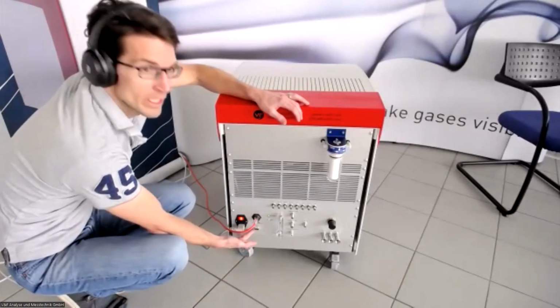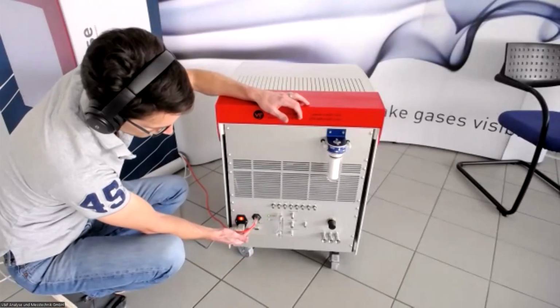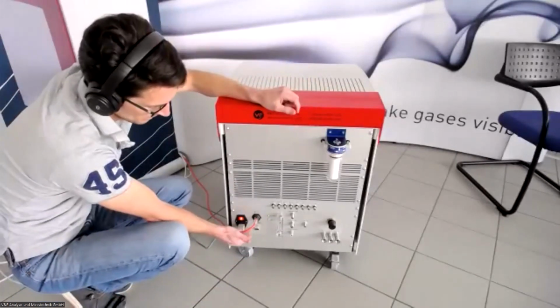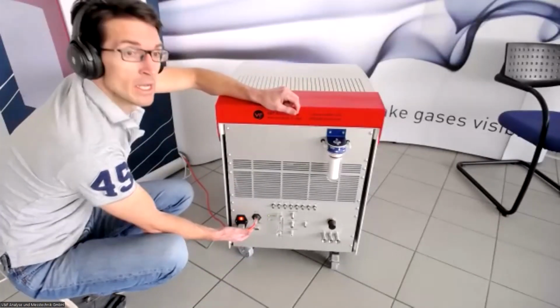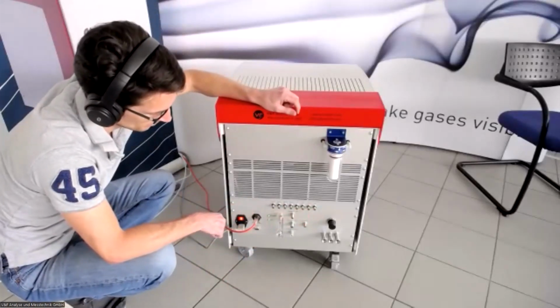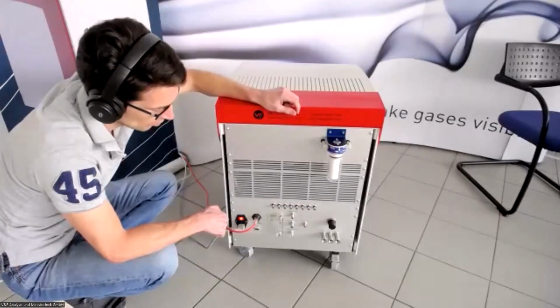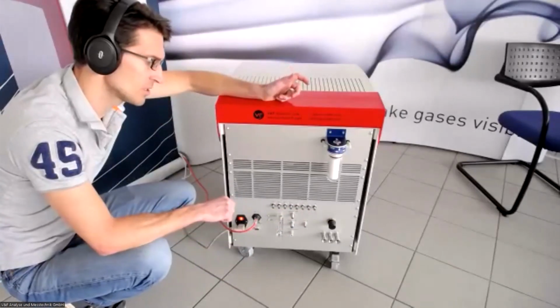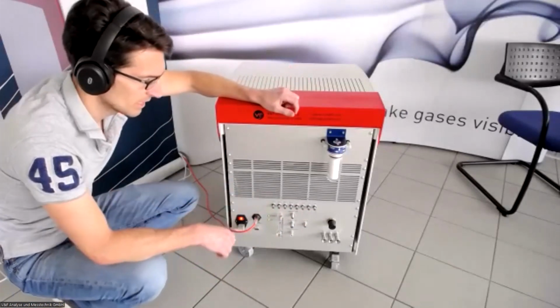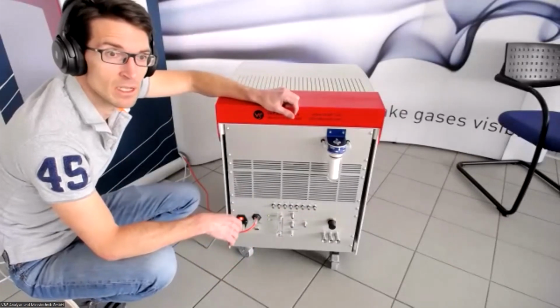The next thing below here would be the RS-232 port. So there's also a possibility to control the instrument via AK protocol over a serial interface. This is also standard on this instrument. We have here all these plugs, these BNCs, which are analog in and output BNC ports. So you can also supply signals into the instrument or take the signal of hydrogen out on one of the analog out ports in the form of a voltage between -10 and 10 volts.